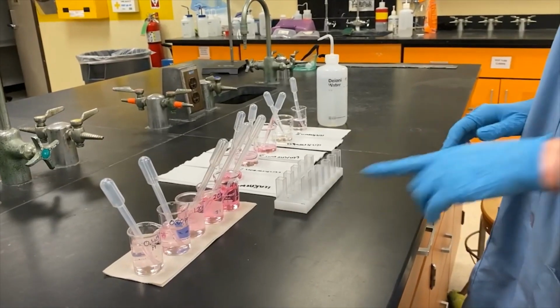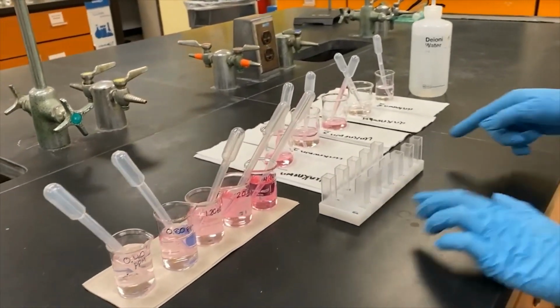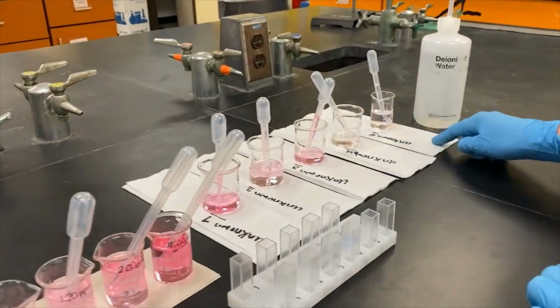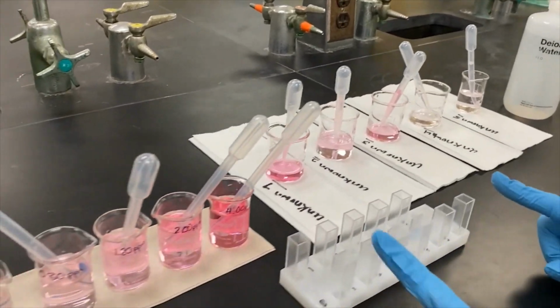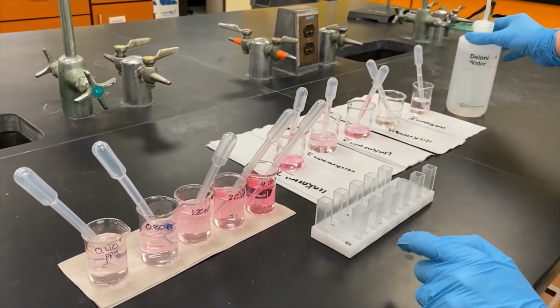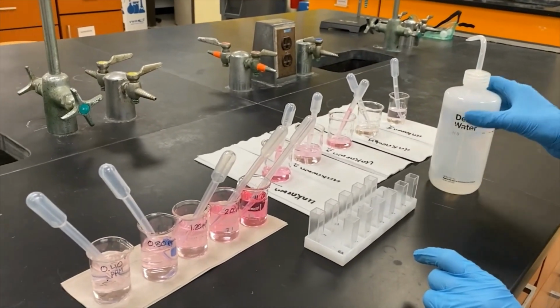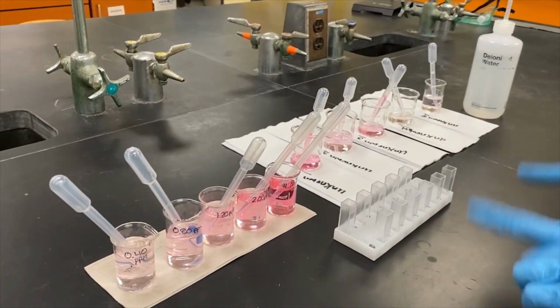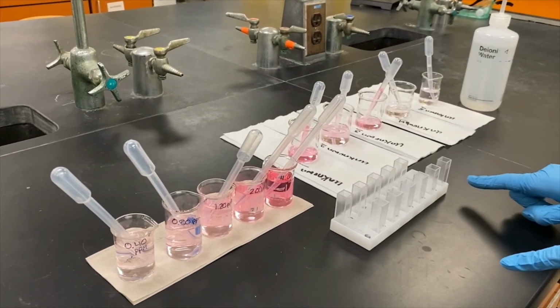Okay, so you can see here, these are our 5 known solutions that we just made, and then we have our 5 unknowns here. So in total, we have 10 solutions. We have 11 cuvettes, and the reason we have 1 extra is because we need to have that blank solution. So we're going to fill that with deionized water, and I'm going to show a clip to you real quick explaining the importance of picking your cuvettes accordingly.